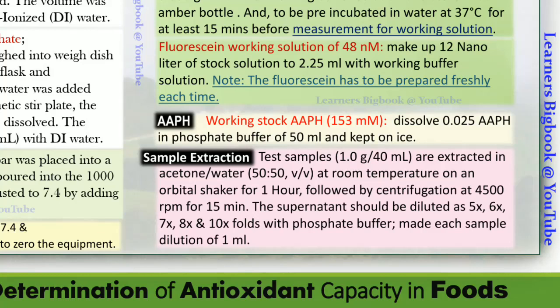Like this there are many where they are measuring the ORAC also. So what we have taken is the plant sample itself, but we are not mentioning which plant and what part of the sample we have taken. But this particular extraction can be done to any part of the plant, and you can extract the sample.